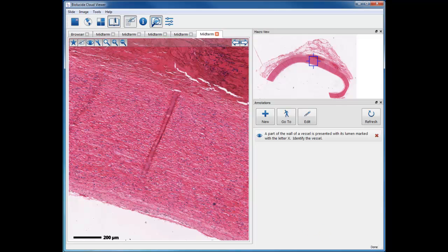All right, I hope that that is helpful. Just remind you to take advantage of the Zoom feature, look around, see the context, and hopefully synthesize what you learned in lecture and lab, think about it, and come up with a correct answer.